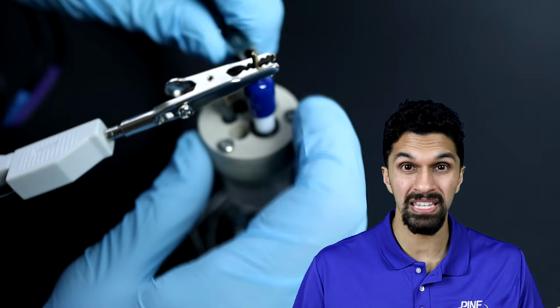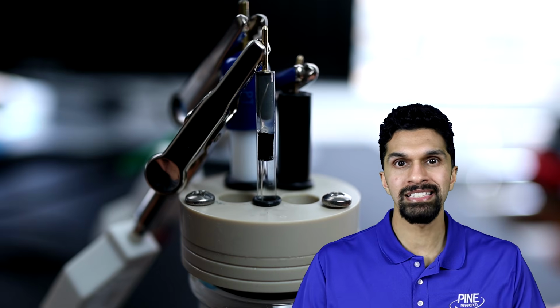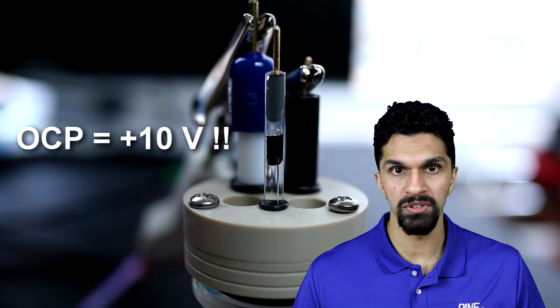Now, you might have been recommended to take the open circuit potential prior to doing a cyclic voltammetry experiment, but you had no idea why you should do that or how it even works. Well, when I was a graduate student, I used to take the open circuit potential prior to doing a cyclic voltammetry experiment for one simple reason. It was an easy, non-destructive technique that allowed me to quickly determine whether I had set up my electrochemical experiment properly. For example, if I accidentally forgot to connect my reference electrode to my electrochemical cell, the open circuit potential will be something crazy like plus 10 volts.